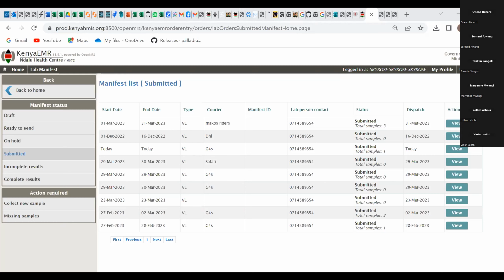Thanks, Songok, and thanks, Patrick, for the question. So I think the errors 400 and 500 are associated with the HTTP. So much of the time it's about the HTTP resource.